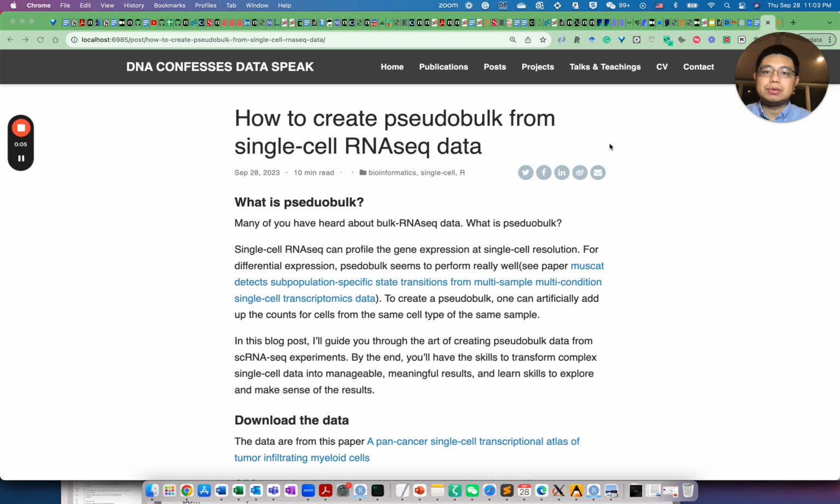So in today's video, I'm going to share with you how to create pseudo bulk from single cell RNA sequencing data. I will also show you how to use Harmony to correct batch effect. So make sure you stick to the end.